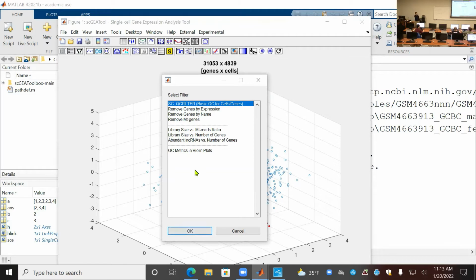There are different options, but the first one is already set up. There are different combinations of parameters we want to use. We may spend some time on this later, and then you have time to go through the other stuff.